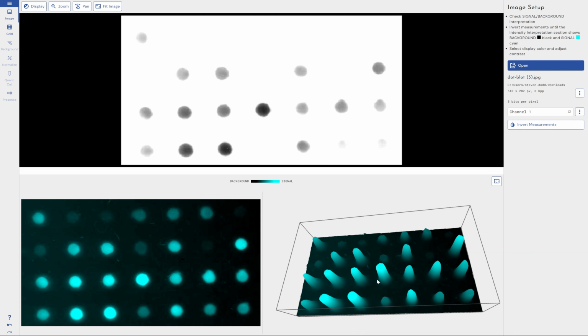Whilst Phoretix 1D is concerned with quantification and analysis of immunoblots like northern, southern, eastern, western blot bands, lateral flow tests, things like that, array is more focused around quantifying circles and comparing them to each other. But there's a lot of overlap in terms of what people want to do with their experiments once they've got the image, so a lot of the rules from Phoretix 1D apply here. If you've not seen the videos on Phoretix 1D, and you only do array-based experiments, then I'll quickly go over them.